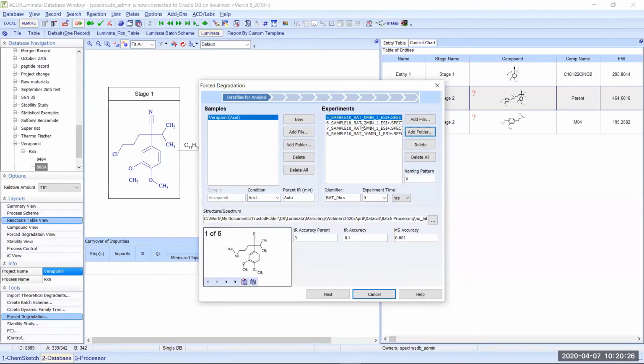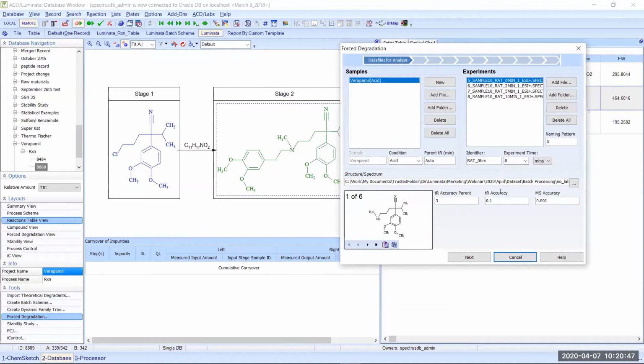And again, in these cases, when I'm looking at LCMS data sets, since I haven't found all my degradants, they haven't been processed at all. So here, I can just load everything, see what they are, and then just view it. From there, I can choose differing time points. So in this case, let's say if I use minutes, I place it under minutes. And the most crucial thing at this point is because I'm taking a degradant list, it populates down below. So this is the SD file that it's populated.